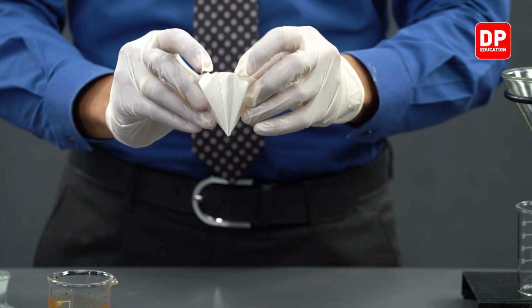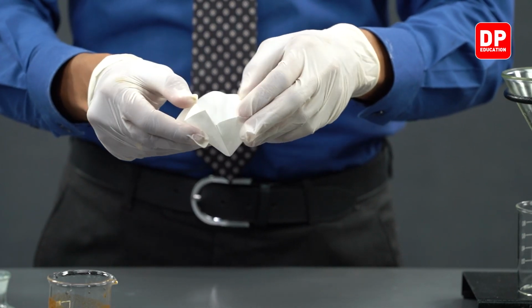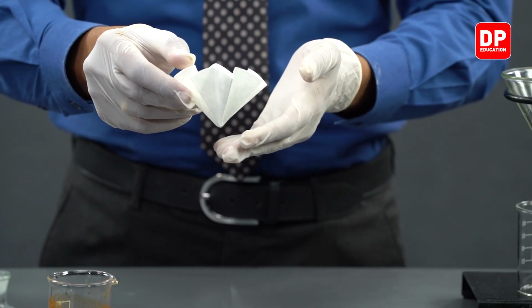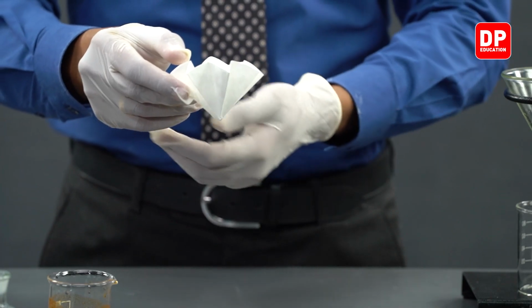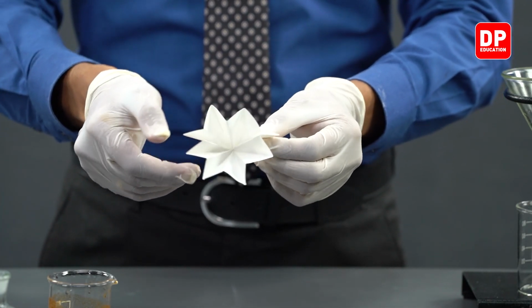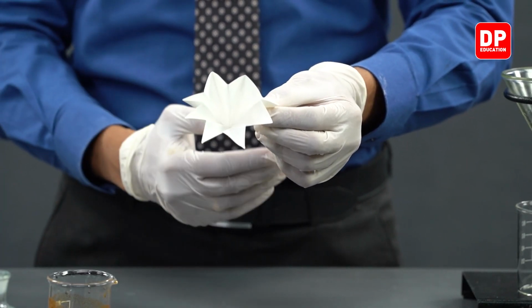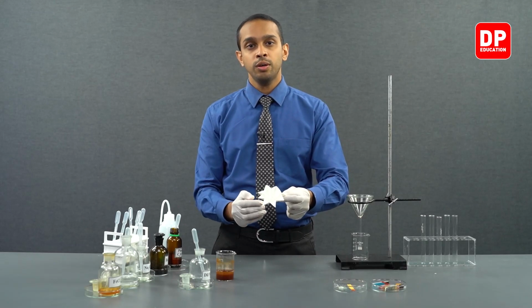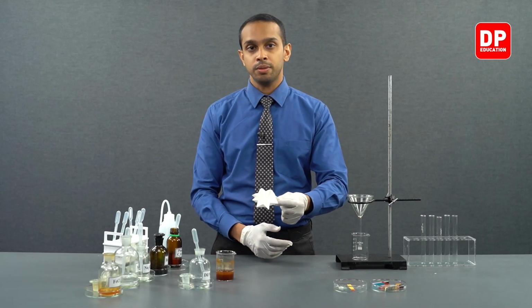Now, this will increase the surface area that is going to be used for the filtering process. So, when you have a filter paper folded up like this, it will increase the surface area that is used for filtering of this suspension.